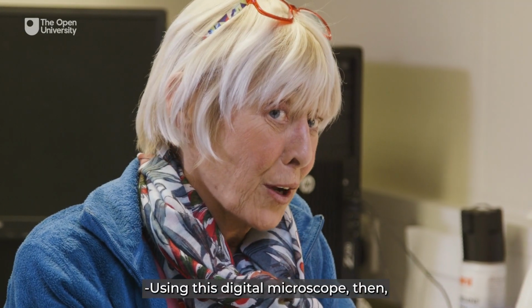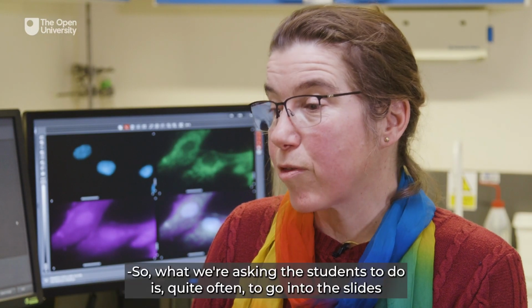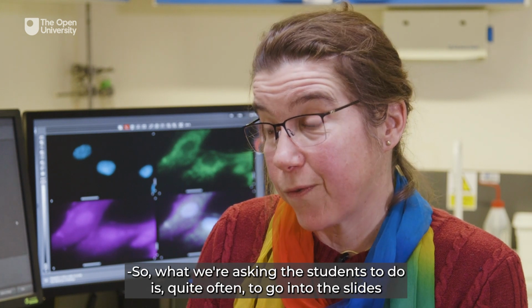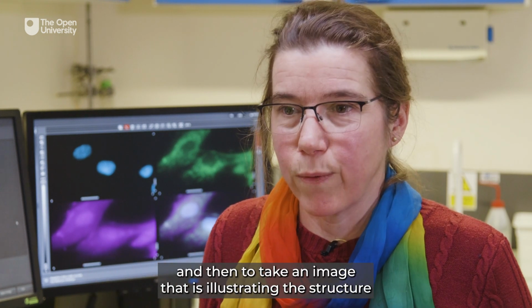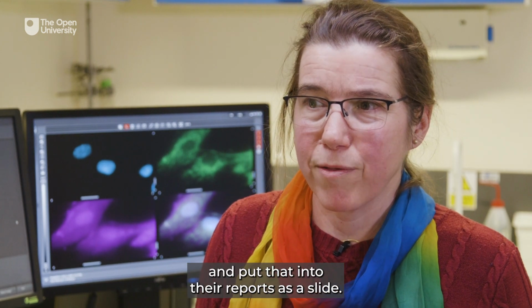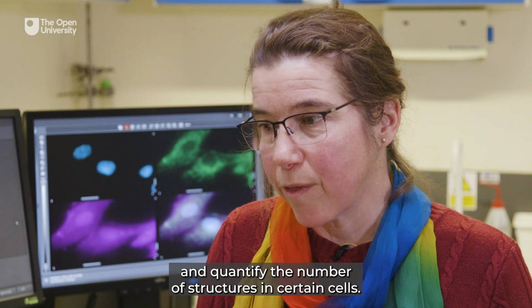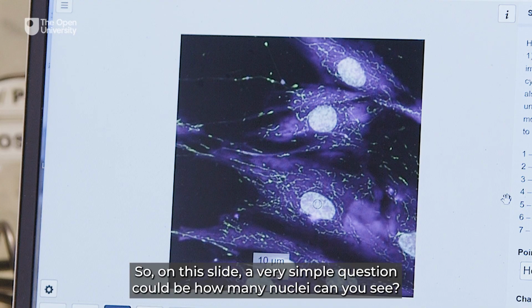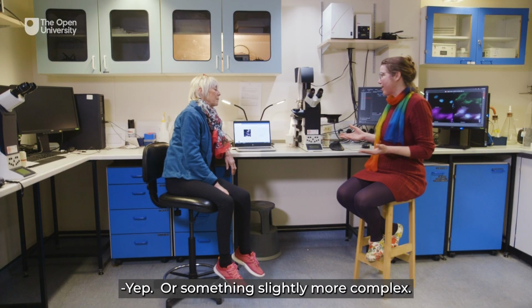Using this digital microscope then, what kind of data do the students collect and how do they use it? What we're asking the students to do is quite often to go into these slides and identify a particular structure inside the cells, and then take an image that is illustrating the structure and put that into their reports as a slide. We also ask the students to count and quantify the number of structures in certain cells. On this slide, a very simple question could be, how many nuclei can you see? So I count the nuclei, 1, 2, 3, 4, 5, 6, 7, 8-ish. Yeah, or something slightly more complex.